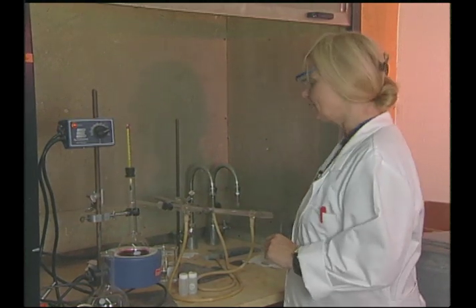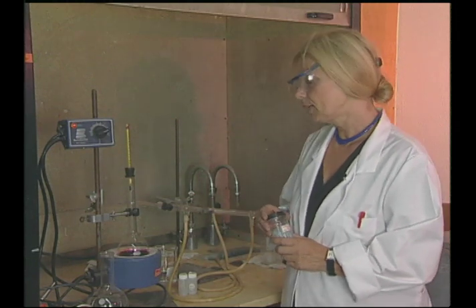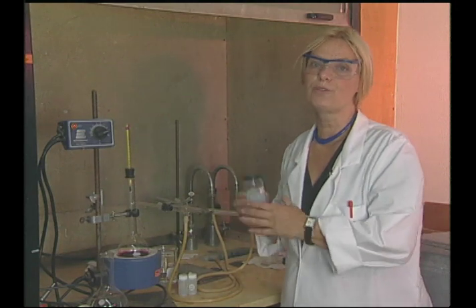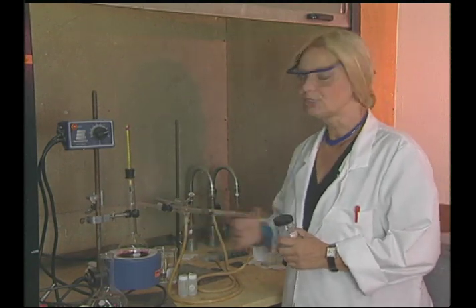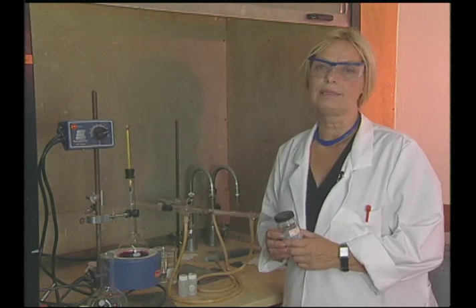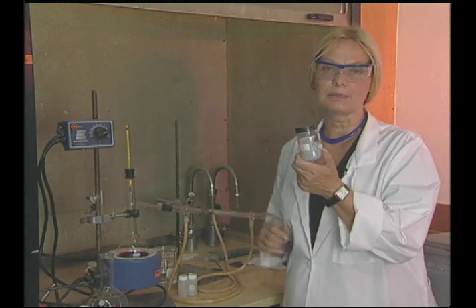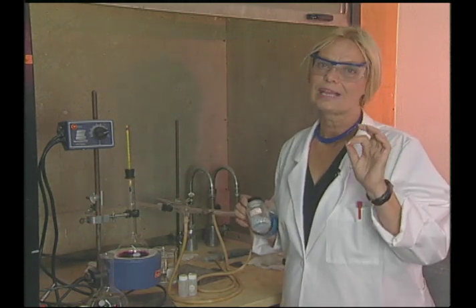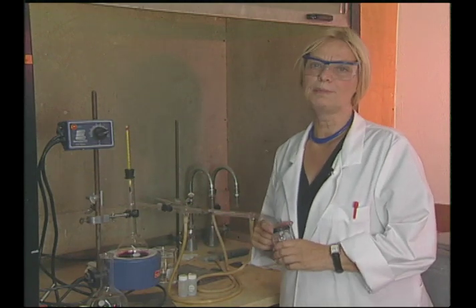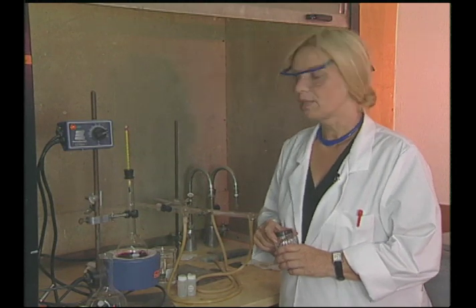What we could have added also, to prevent an intensive type of boiling, are the so-called boiling stones, which ensure a smooth boiling. Now here it's not a big problem, but some liquids shoot up because they're boiling so violently. These boiling stones can be little glass beads or little volcanic pieces of rock that absorb some of the air that produces this violent boiling.